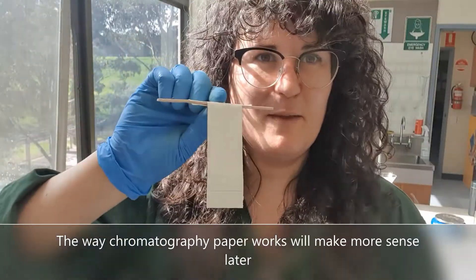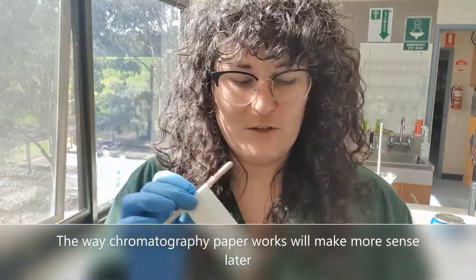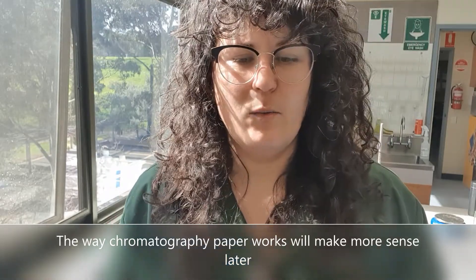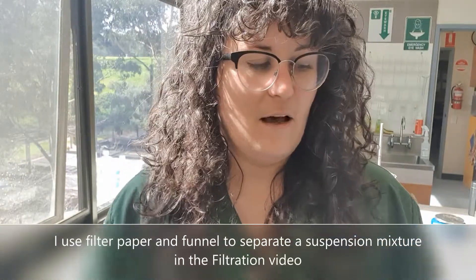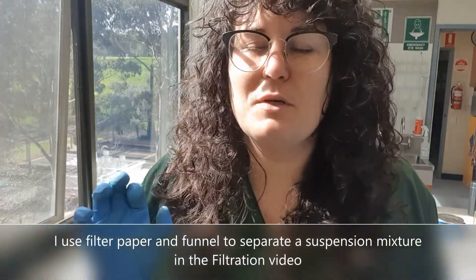If you've read the prac sheet you might have a little bit of an idea. We're going to use chromatography paper, which helps us separate out mixtures. Different mixtures with solids can be separated using filter paper, dissolved mixtures can sometimes be separated with crystallization, and another way we can separate mixtures is with chromatography paper.